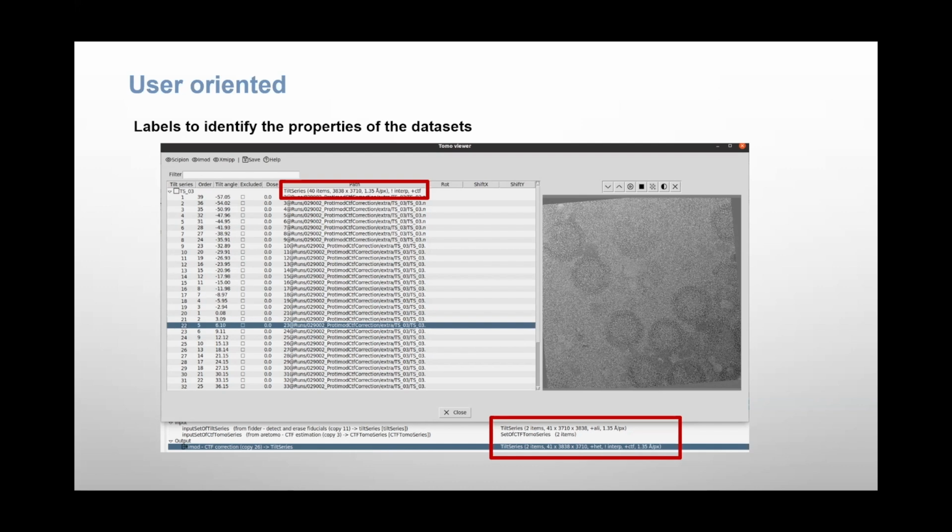All objects that you can find in tomography have been modeled, like, for instance, in this case, a tilt series. So what does a tilt series have? It has tilt images. In this case, we have a tilt series, as you can see in the center, that is composed of 40 tilt images. The images have a size and a sampling rate.